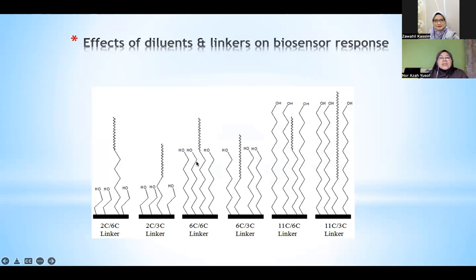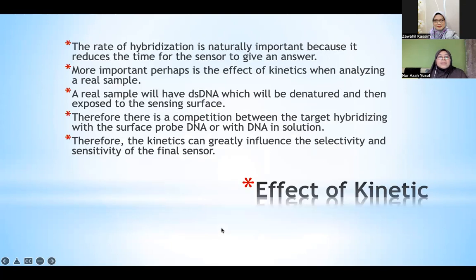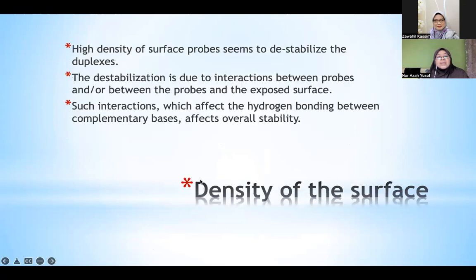These are the things that we can also modify in order to have a good response. You can see this is the spacer, and we can study the length of the spacer. And this is the DNA probe. Sometimes it's good to have a very long DNA probe because it is more accessible. If it is too short, the extracted DNA will have difficulty approaching the DNA probe. So the rate of hybridization is naturally important. This has to be optimized and studied: which length is the most optimum and suitable? This requires detailed study.